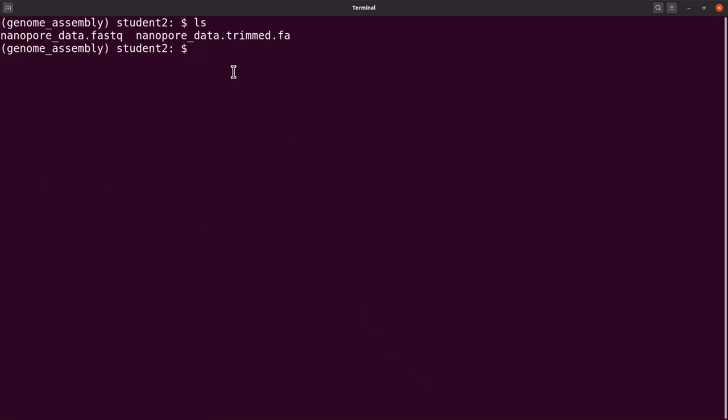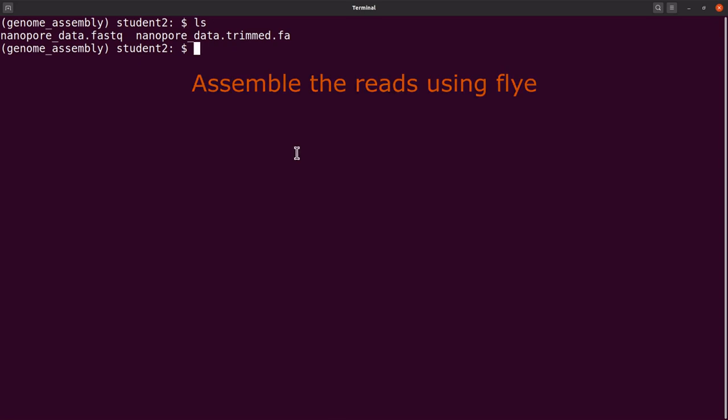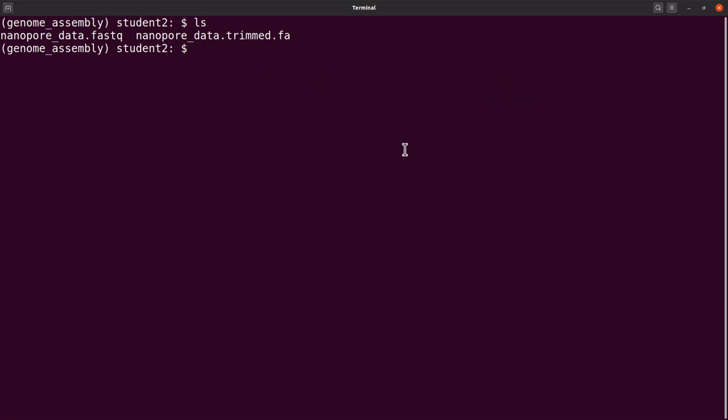So the next thing to do now is to perform the genome assembly using Flye. You just do the assembly, including some parameters, and I will explain them as we go.